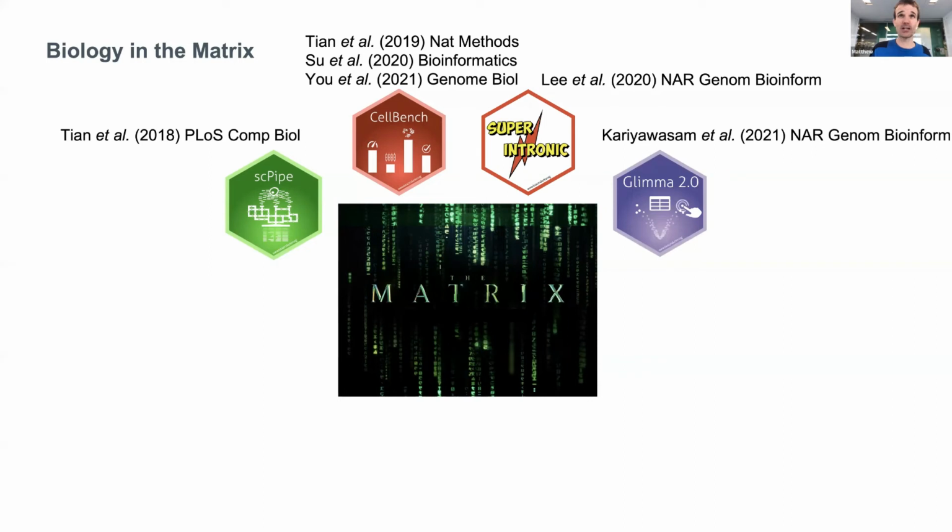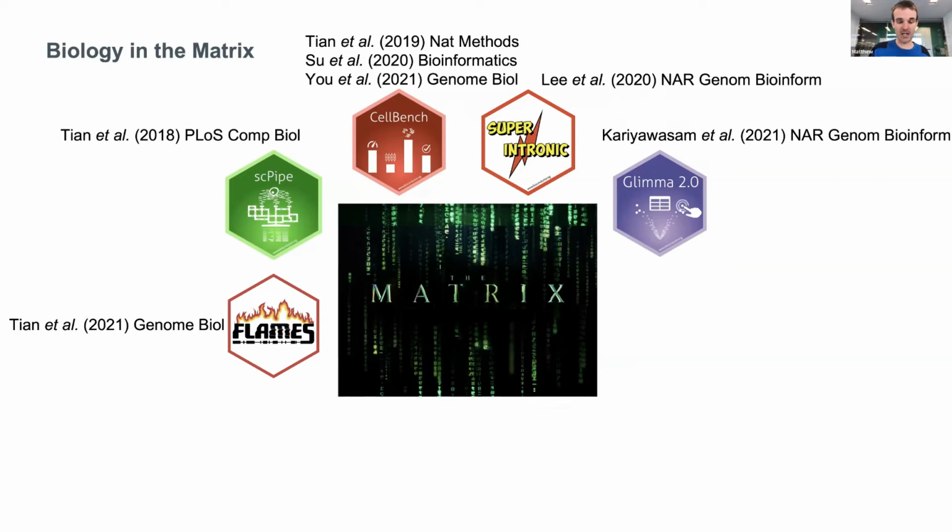And also a nice point and click package, so that once you've done your gene expression analysis and you have your results, you can search through them in more detail. But today I want to talk about a really exciting application which has led to some software called FLAMES to explore single cells and get isoform level information, which up to now has been something people have mostly overlooked, I feel.